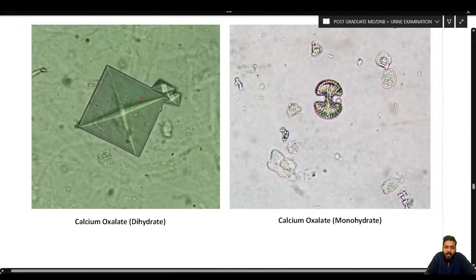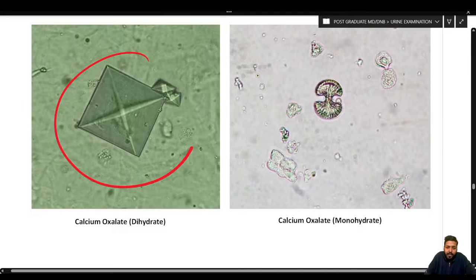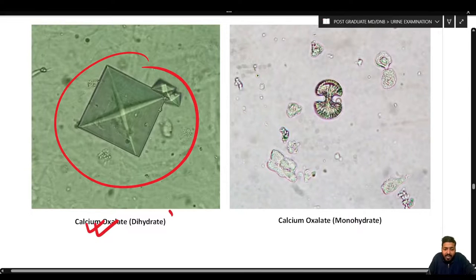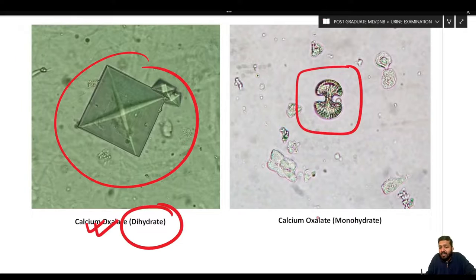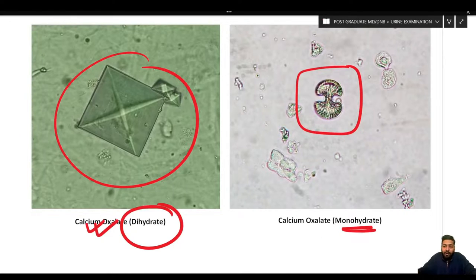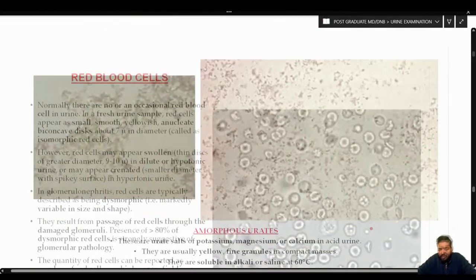On the left-hand side you can see the envelope-shaped crystal — this is a calcium oxalate dihydrate crystal. On the right is the dumbbell-shaped crystal, which is basically the monohydrate form. Both can occur in normal urine.